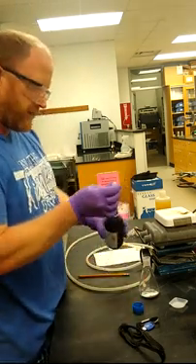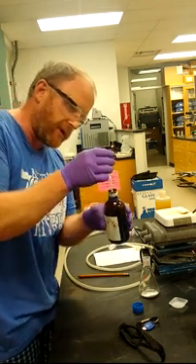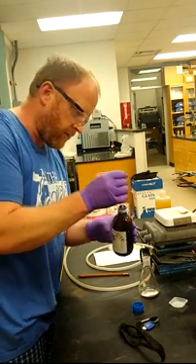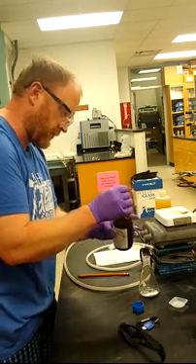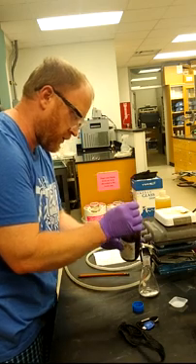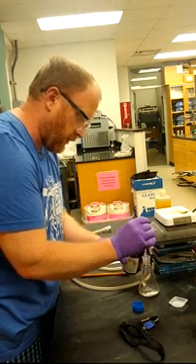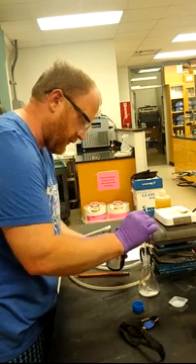We've got 5 ml and this is a 1 ml dropper. I'm just estimating since I didn't grab a cylinder earlier. So I'm counting out five droppers worth and then that's going to be added.